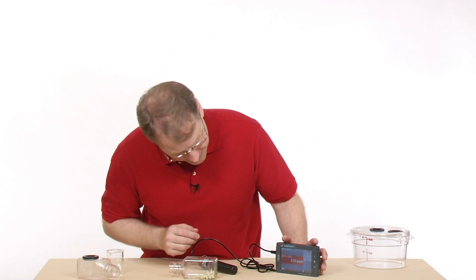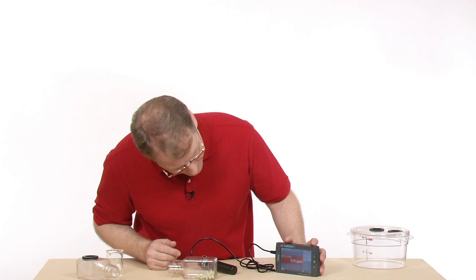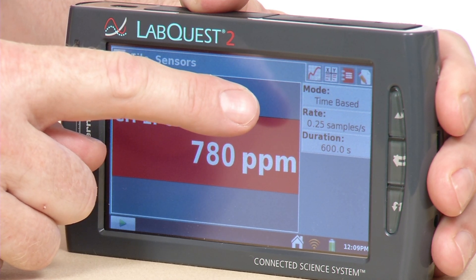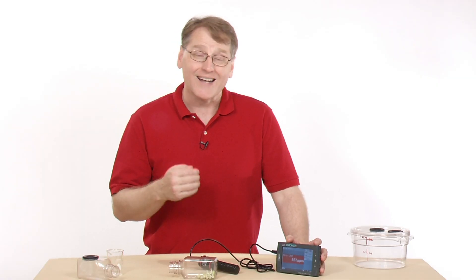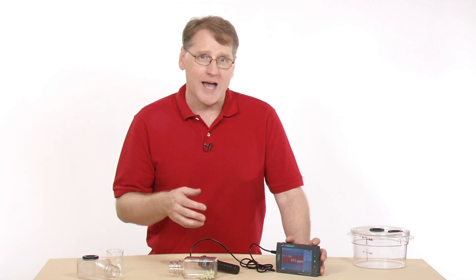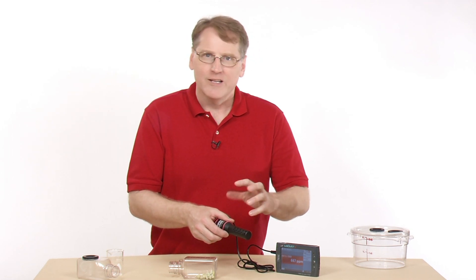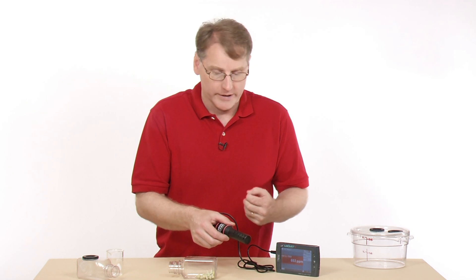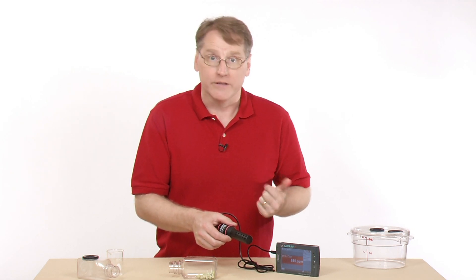Our unit is now reading, and inside our room we've got about 600-something parts per million. Looking at our collection parameters in the upper right corner, we see it's time-based — CO2 concentration as a function of time. The default rate is 0.25 samples per second, meaning a measurement every four seconds. Because CO2 has to diffuse through these holes, it may not change rapidly, so collecting faster than that isn't necessary and just generates more data than needed.